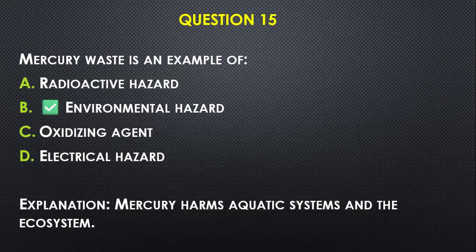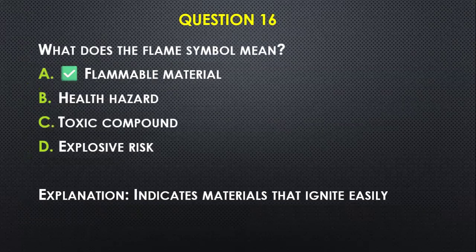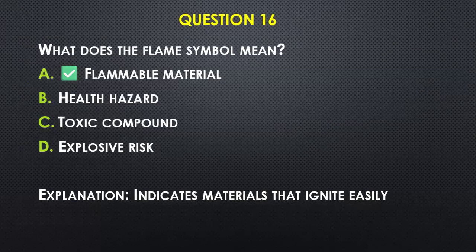Question number fifteen: Mercury waste is an example of — A) radioactive hazard, B) environmental hazard, C) oxidizing hazard, D) electrical hazard. Mercury harms aquatic systems and is known to accumulate in the adipose tissues of both fish and other animals, so it is an environmental hazard.